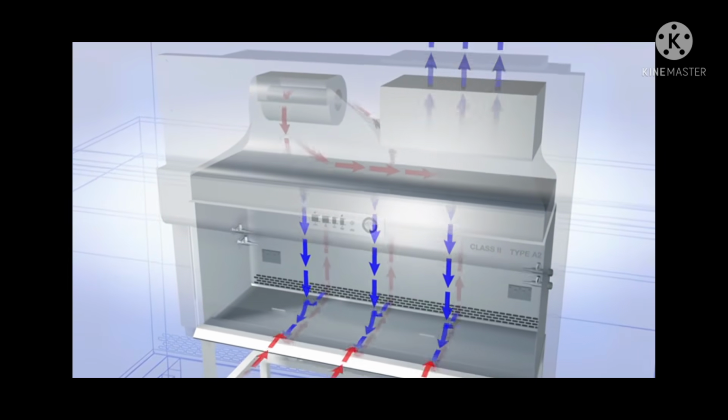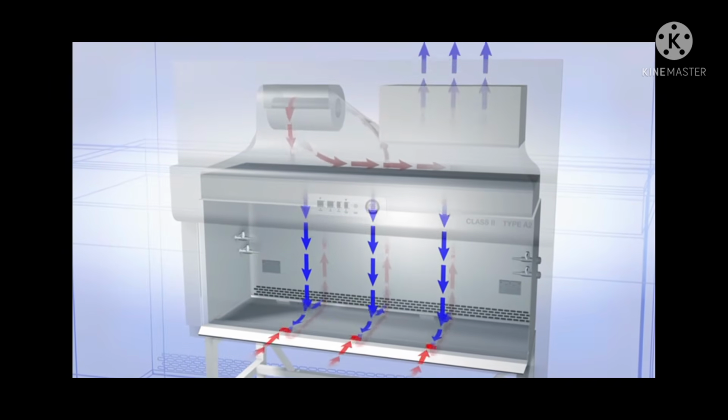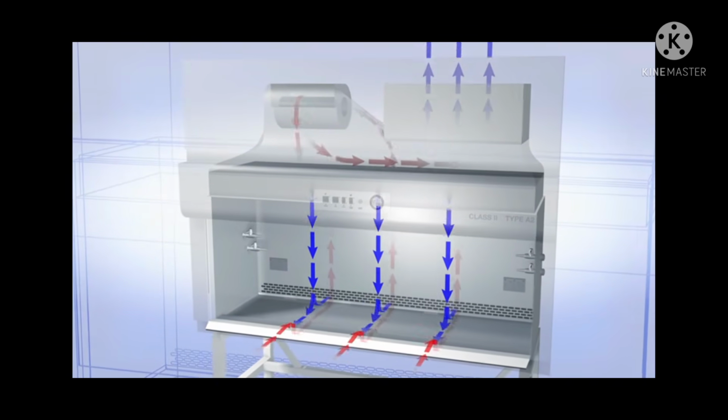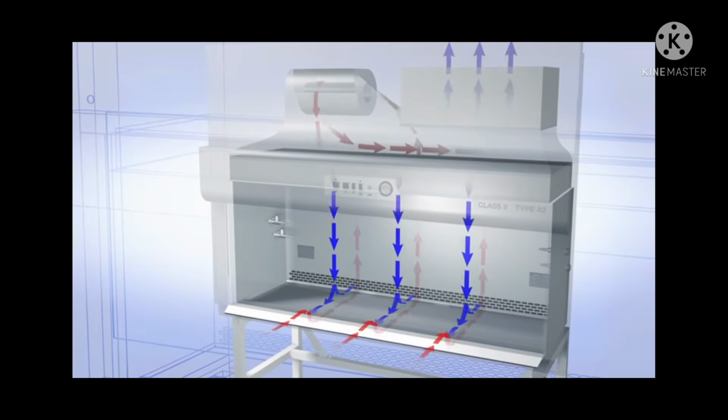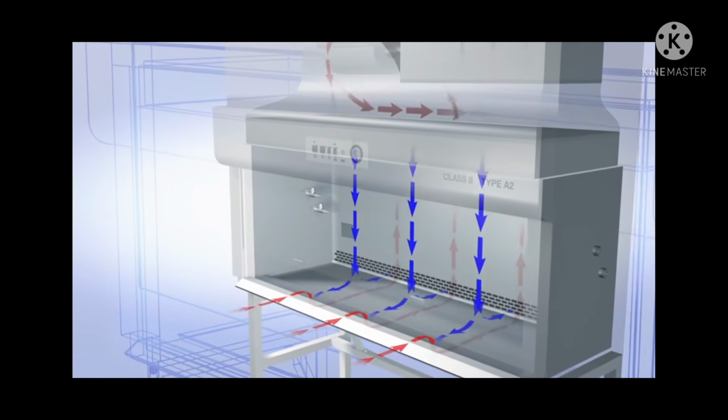30% of the filtered air is exhausted. The remaining 70%, which is now HEPA filtered, is recycled back into the workspace. To ensure maximum protection in using a BSC, here are some essential reminders.